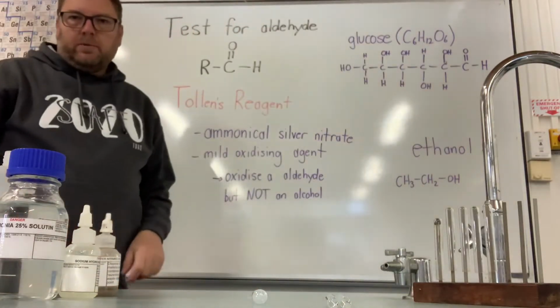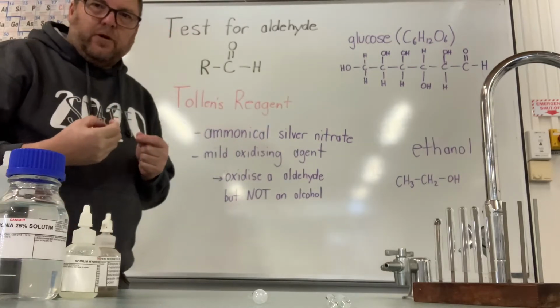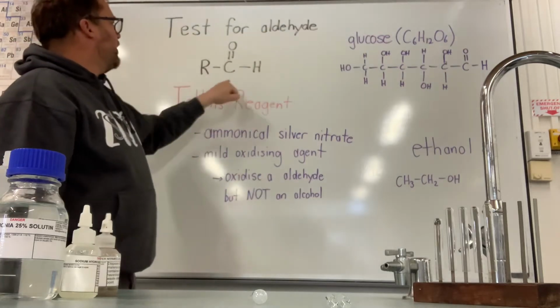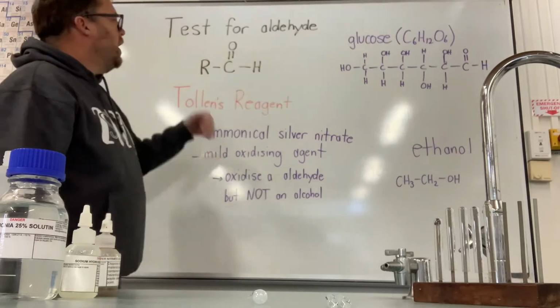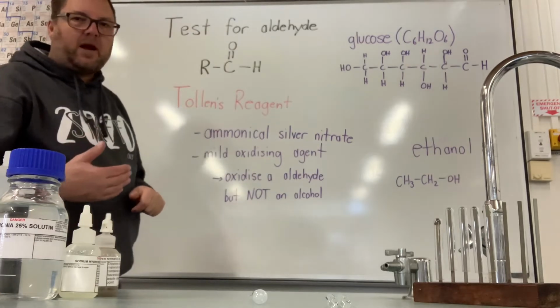Okay, welcome to the virtual laboratory. The first thing I'm going to demonstrate today is the test for an aldehyde. If you remember, the aldehyde has this functional group here with a carbon with a double bonded oxygen and then a hydrogen. We usually form an aldehyde from the oxidation of the primary alcohol.